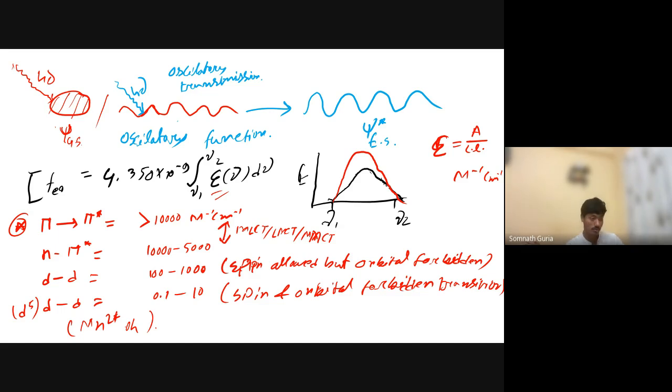metal bond. Okay, so the electronic transition of the molecule happens due to the light matter interaction. In that light there are two fields, one is the magnetic field, another is the electric field. That electric field is mainly responsible for the electronic redistribution in the molecules.